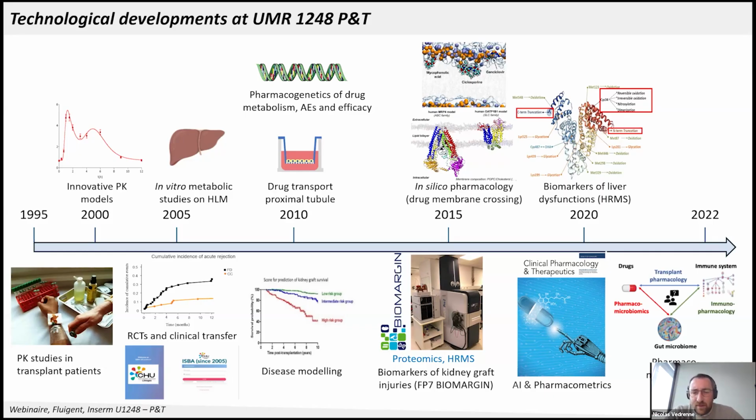It's important to know that microbial enzymes can activate or transform immunosuppressive compounds, and microbial metabolites modulate host pathways relevant to graft health. So that is very important. And to finish, we have naturally converged toward our most recent focus, organ-on-chip and multi-organ-on-chip microphysiological systems, as described previously by Izzy.